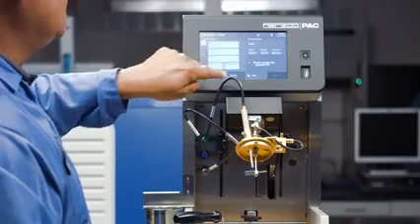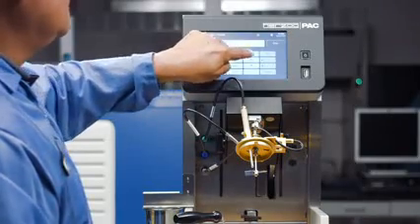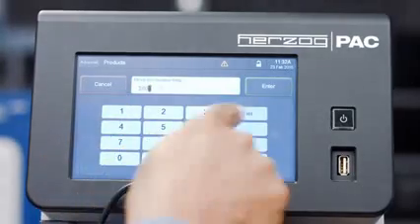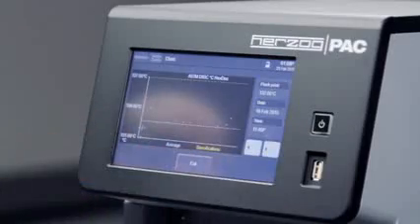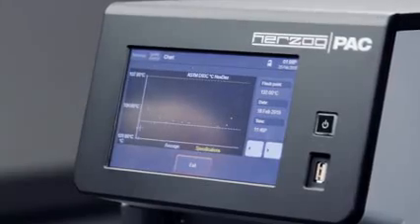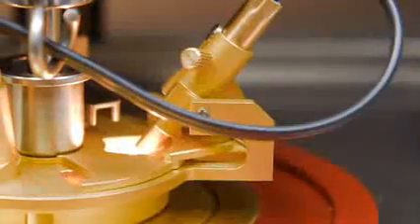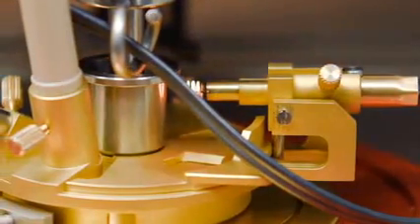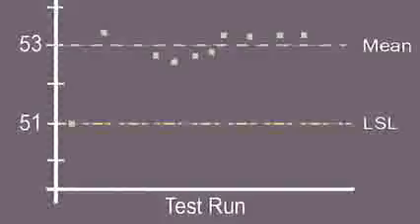The new OptiFlash also includes built-in quality control functions, which allow users to enter specification limits by product. The OptiFlash can then provide a pass-fail result for simple test analysis. In addition, the igniter on the unit is continuously monitored so that users can perform preventative actions to avoid downtime.